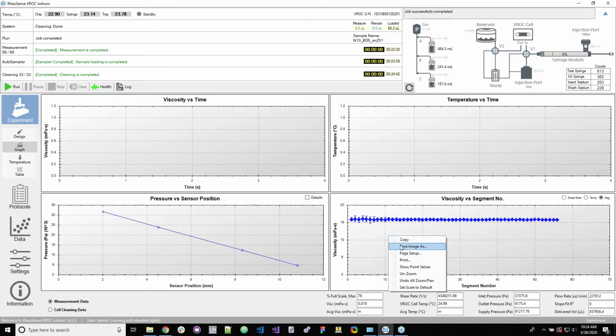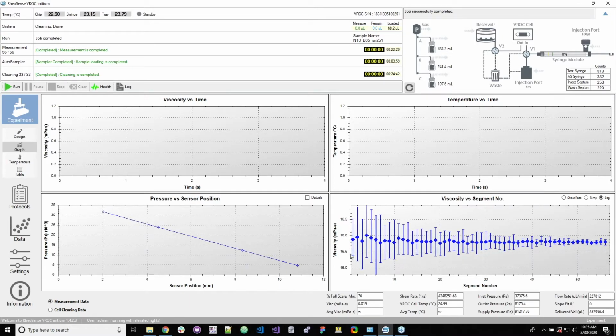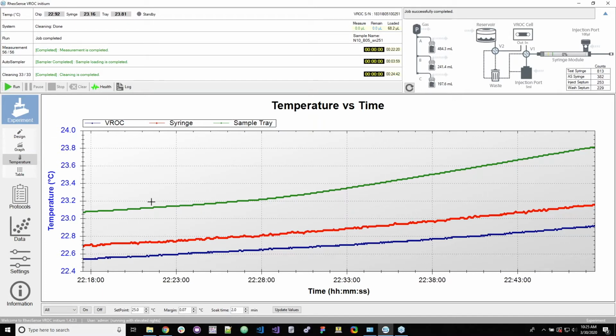So if you right click, you can copy this image, save this image, print this image out, show point values. You can zoom in, unzoom. You can set the scale to default. So this is zoomed way out, but we can click and drag and then keep track of the viscosity as a function of both shear rate, temperature, and segment number. And again, this is the real time tracking of the software. If you want to look at the data once it's already been collected, that would be here in the data tab. So next we have a tracking of the temperature of the chip, which is here, VROC, the syringe in red, and the tray itself here in green.